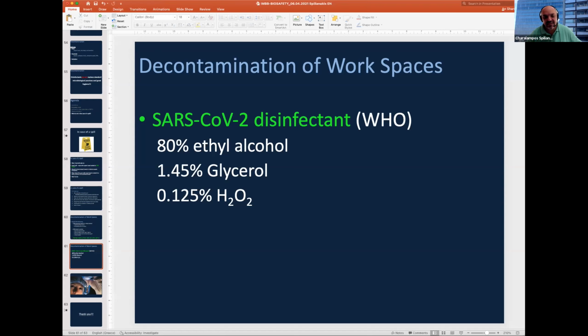If it's airborne transmitted, then you should definitely work in a BL3 laboratory. And we definitely don't have such laboratories at the IMBB, unless you don't work with a living virus, but just parts of the virus, let's say a protein. Then I would guess a BL2 would be fine. And we do have labs working with such material, BL2 designated and not BL3.